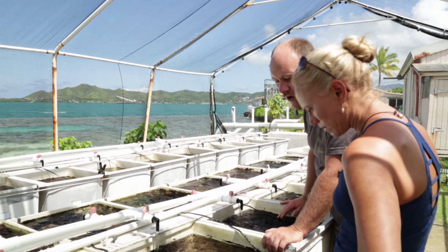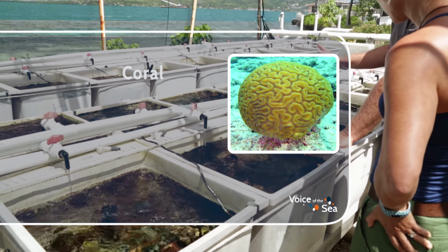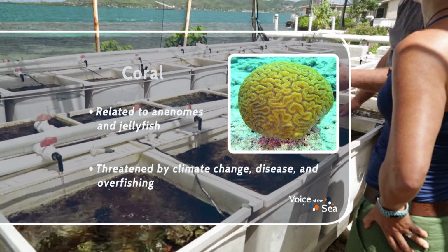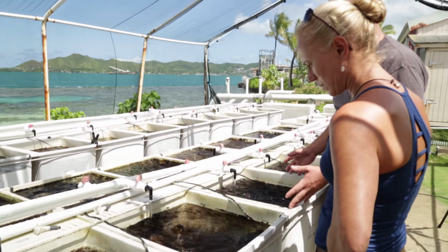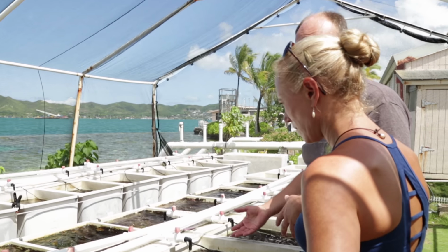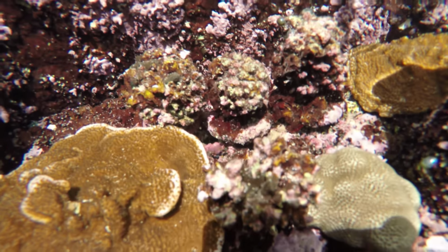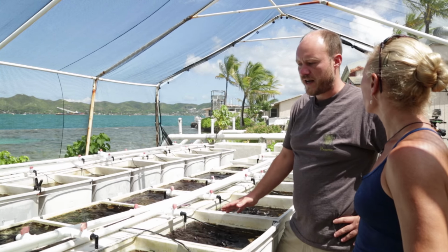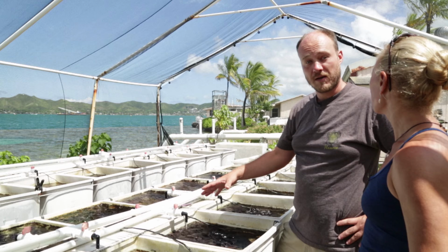And here we've got all of our dominant reef building coral species. We've got 8 different species of corals in here. They're by far the most important contributors to what's generating our coral reefs around here. You can see in some of the tanks, we've got lots and lots of happy, healthy, rapidly growing corals. And in other tanks, growing under higher temperature and higher CO2, like they will be in the future ocean, some of the corals are doing really well. Others are not doing well at all. Others have already died. A big question that we're looking at is what is the potential for these coral species to adapt to those hotter, more acidic conditions that they're going to experience in the future.